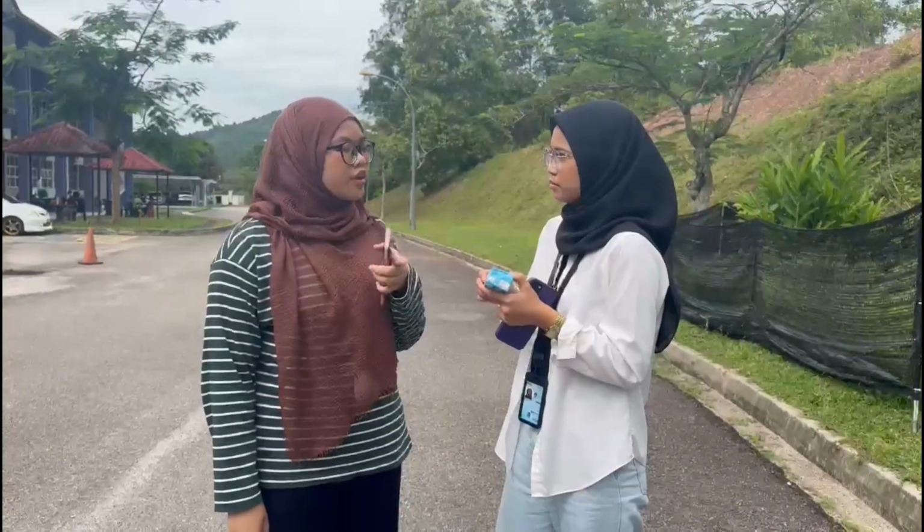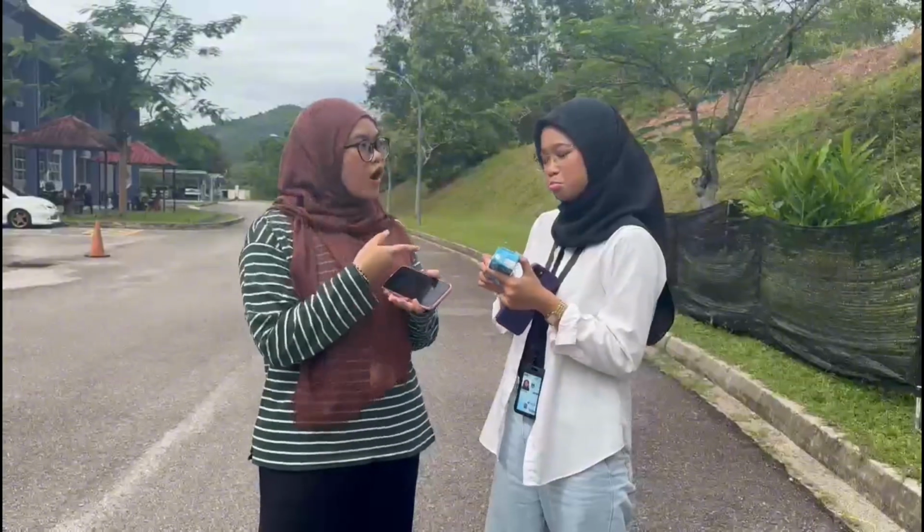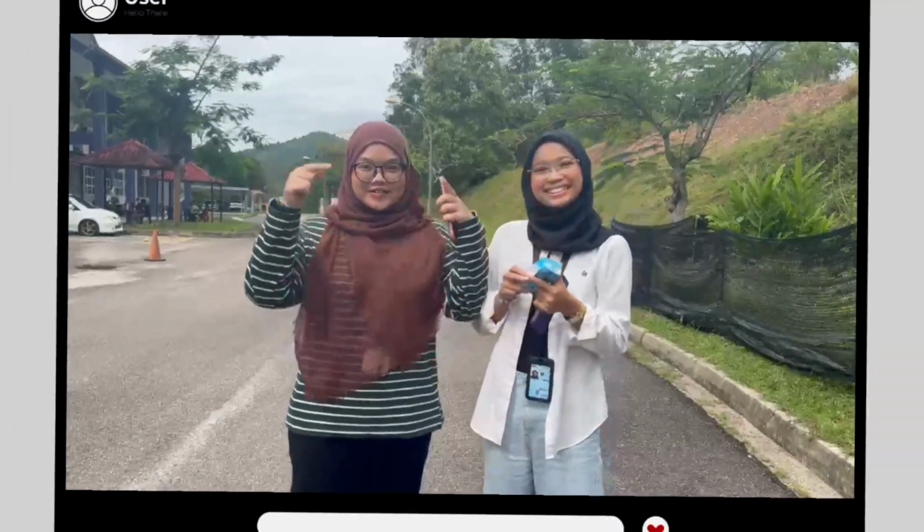I think I know. We can use a volumetric analysis by doing a titration. You want to know how it works? Yes. Let's go.